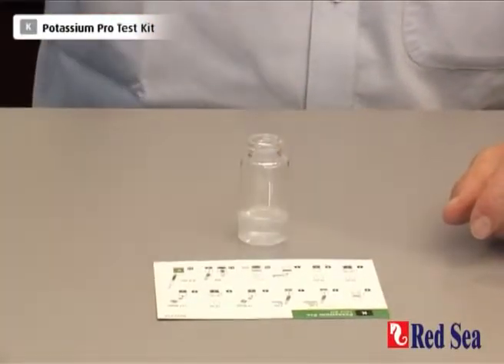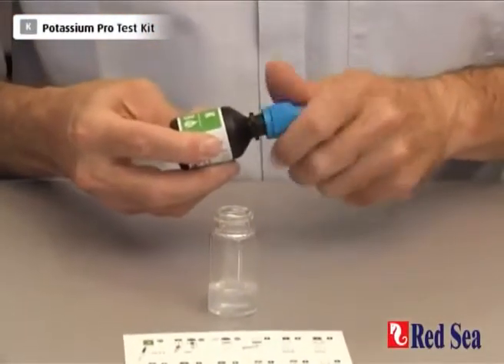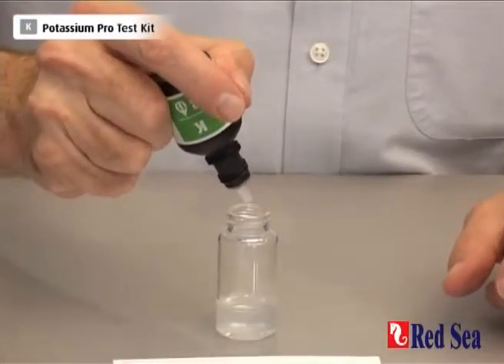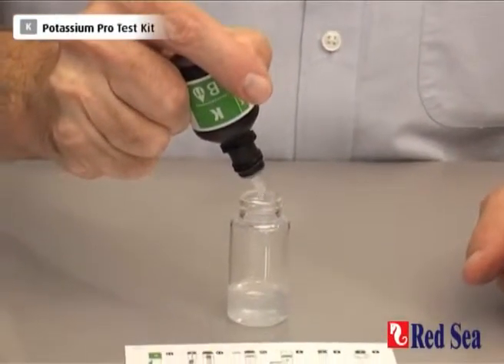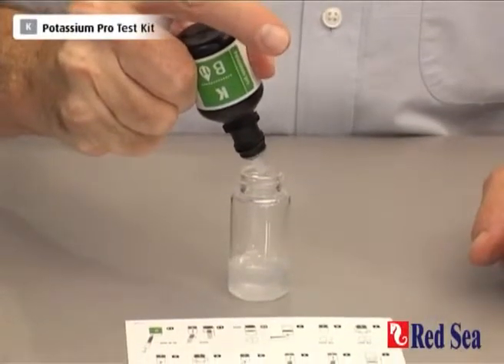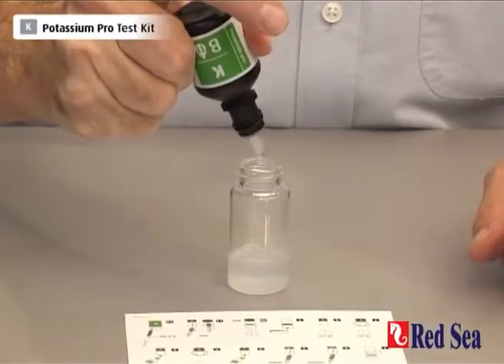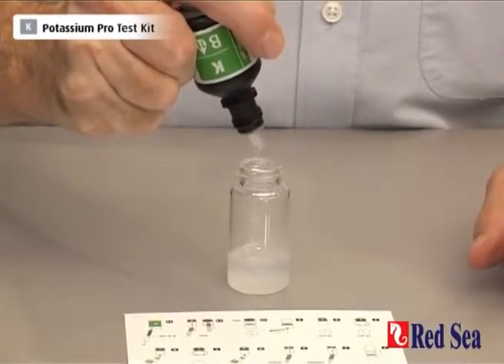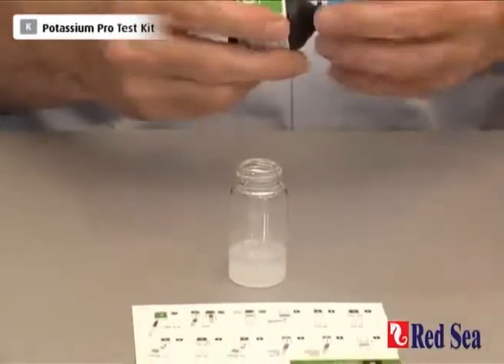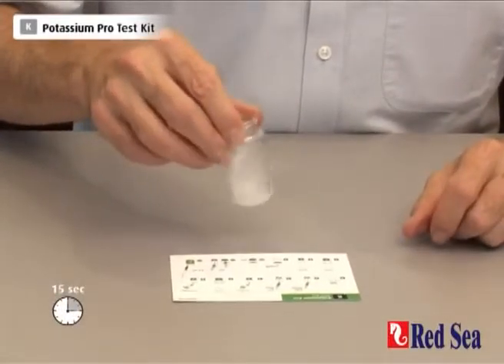We now add 11 drops of reagent B — 1, 2, 3, 4, 5, 6, 7, 8, 9, 10, 11. Again, shaking for about 15 seconds.